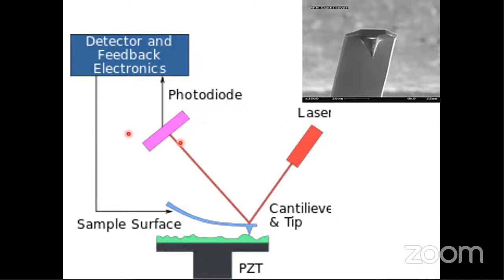So using this microscopy, this is possible. We can also distinguish the sample based on its mechanical properties like hardness, surface roughness, etc. And we can also use this AFM for microfabrication also. Suppose we have to do some atomic manipulation, we have to remove some surface atom, we have to add extra surface atom. This type of advanced fabrication technique can be done using atomic force microscopy.